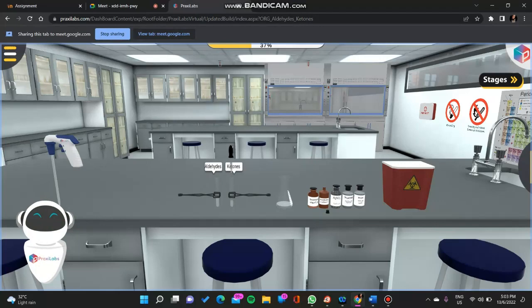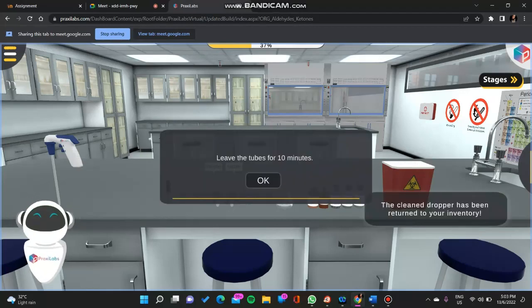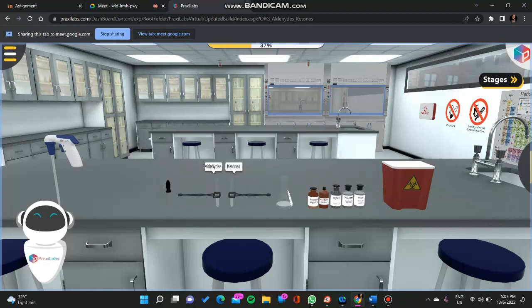So we have to leave the tubes for 10 minutes.